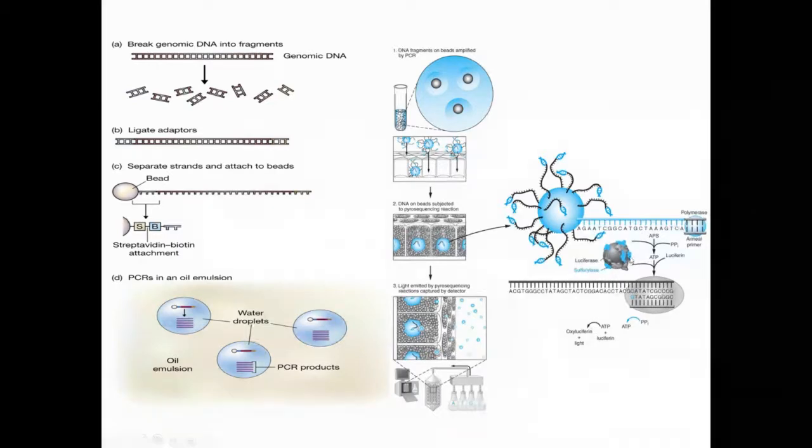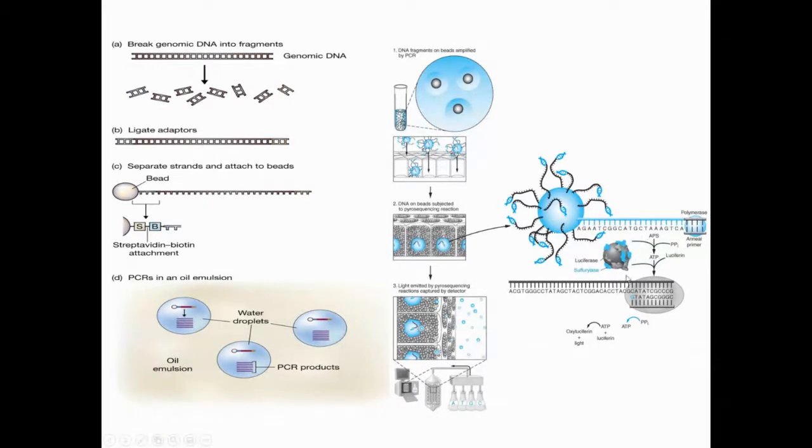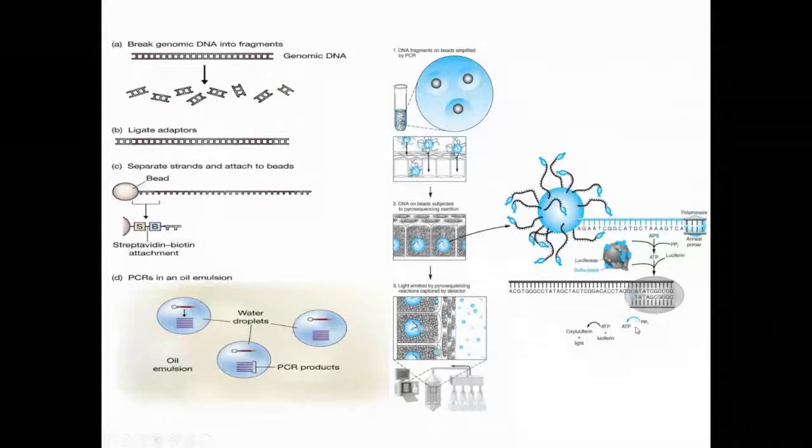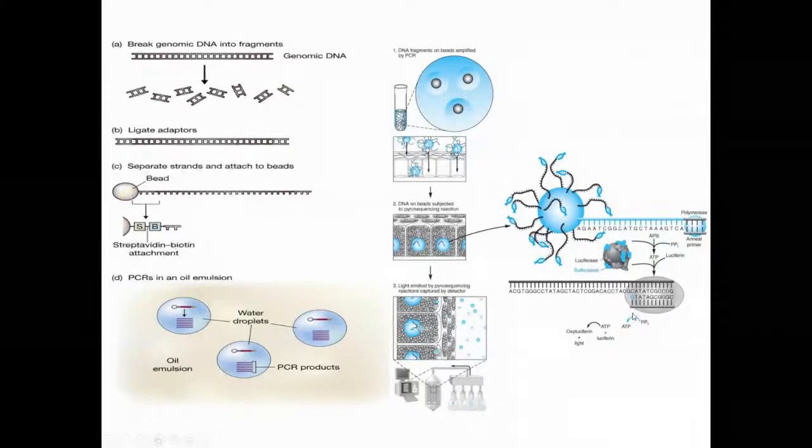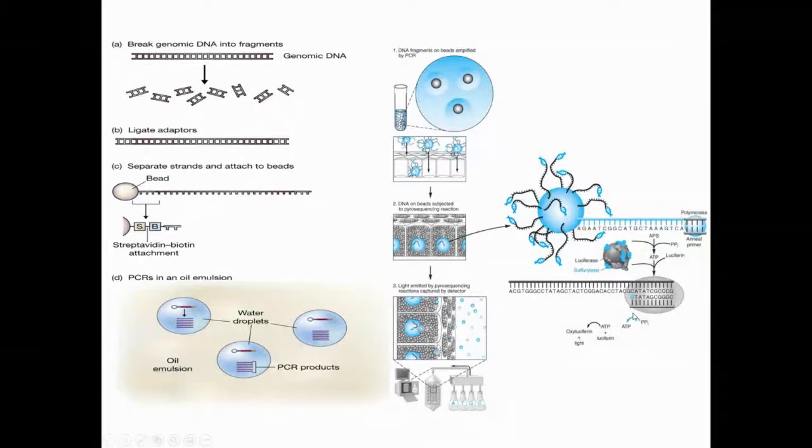Each cycle you do 4 different nucleotides one at a time, and they perform like 100 to 200 cycles, okay? So that the computer can record the signal from each well for the 150 cycles. So normally, massively parallel sequencing can do up to 150 base pairs in a single experiment.